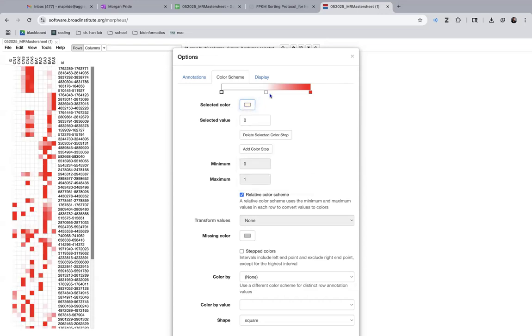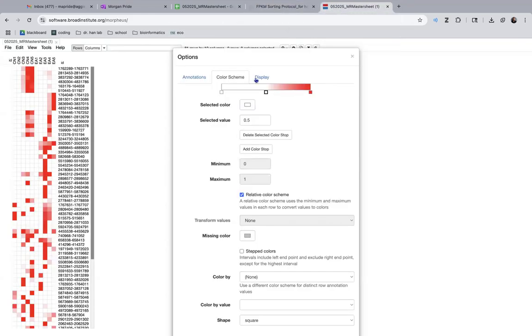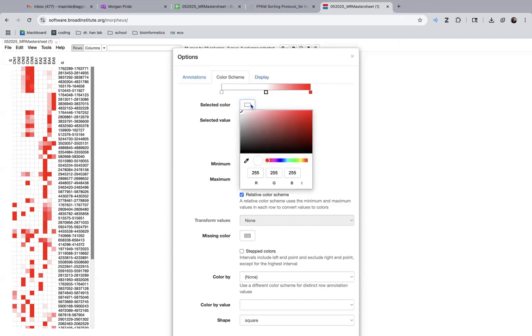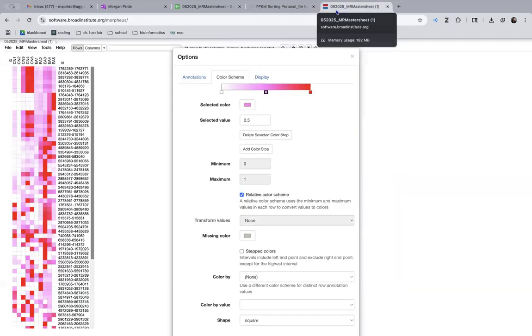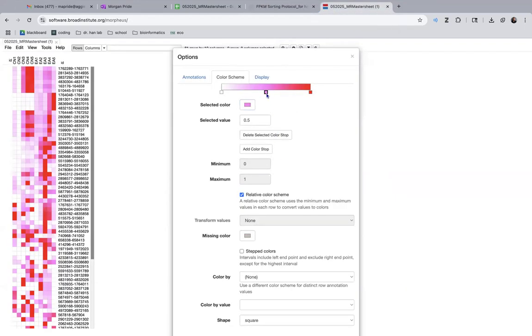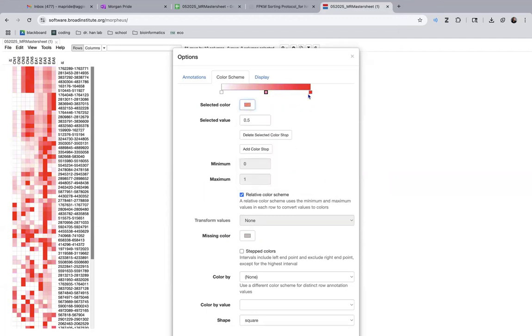Also, I'm gonna add the protocol to your sheet, that way it's easier to understand. 250, 129, 28 or something like that. And then 126? No, 128 and 128. 128. And then the red is fine.